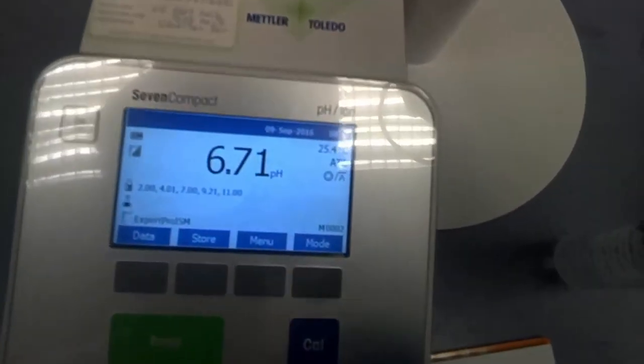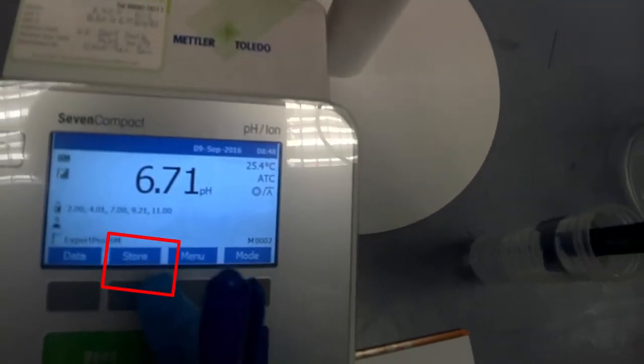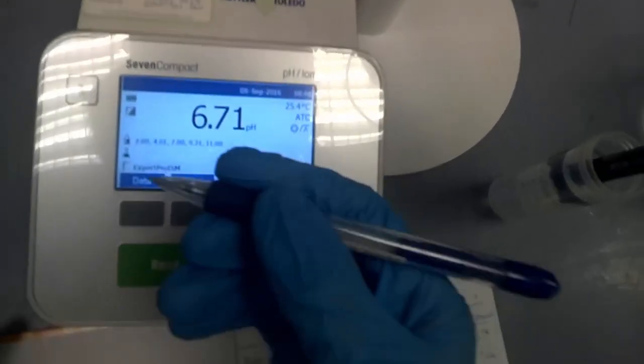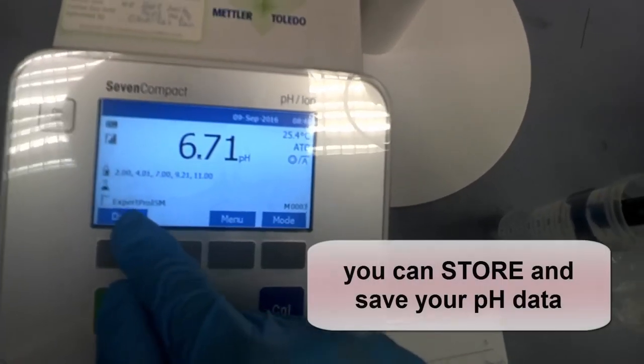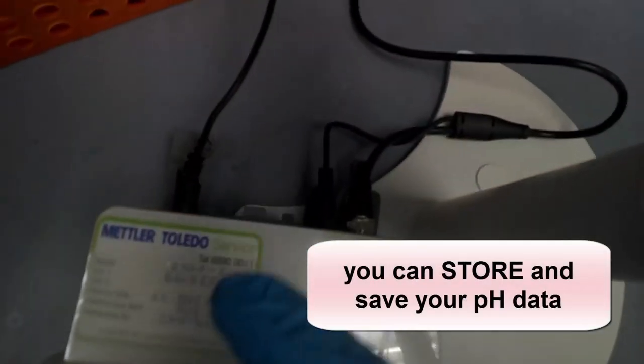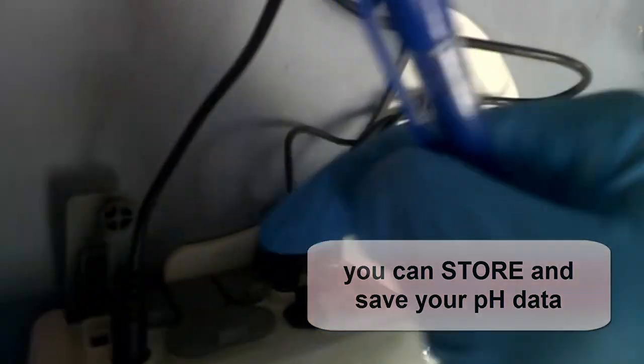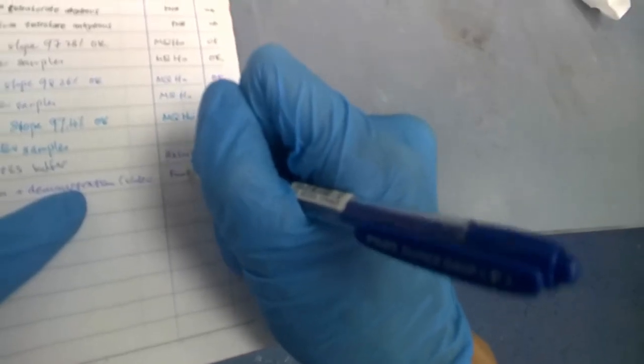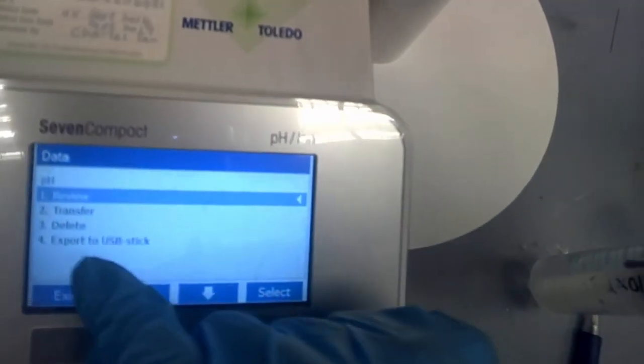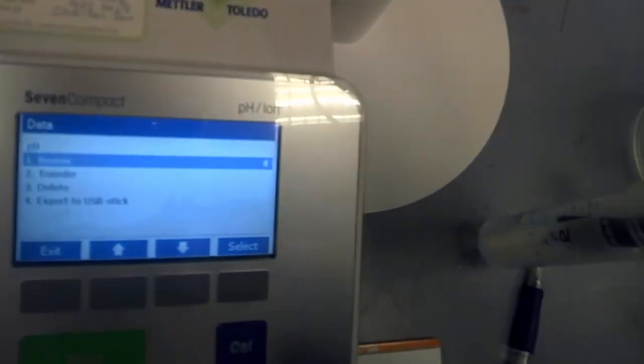So in this case, you see that now, this icon here that says store. That means, in case you're measuring many pH, you can't copy down because your hands are not free. You can store it first. So this reading will be saved. And later, you can even export this data by using a thumb drive. At the back here, there's a USB port at the back of this pH meter. And for data, you can actually export to USB stick at the back there.